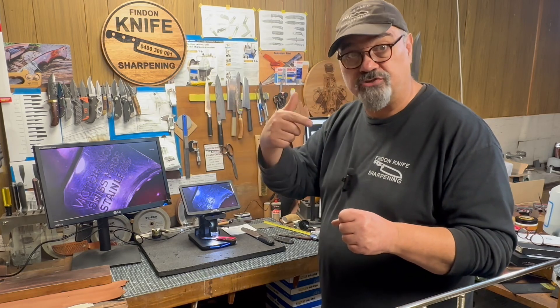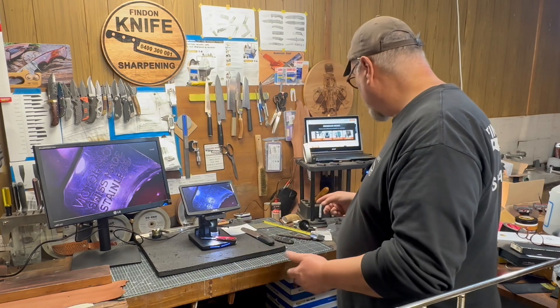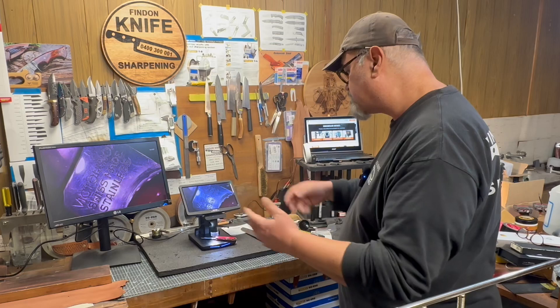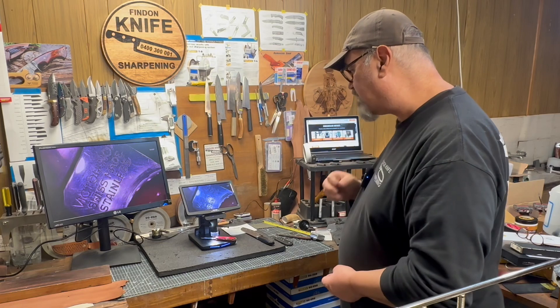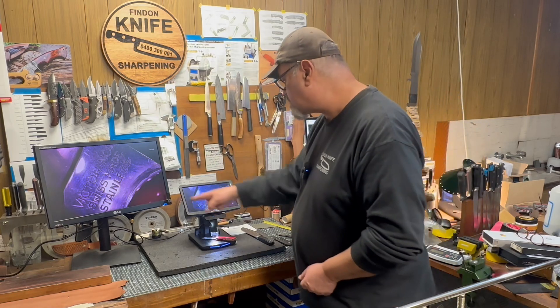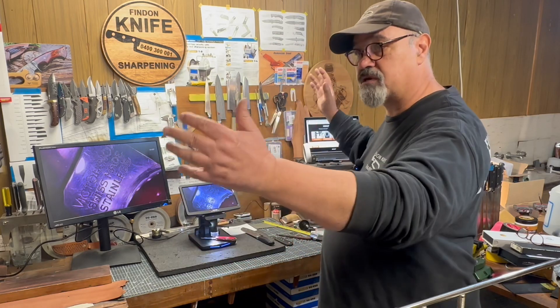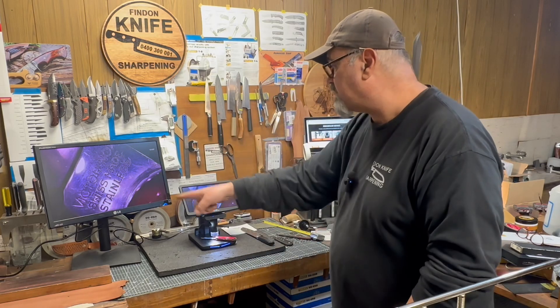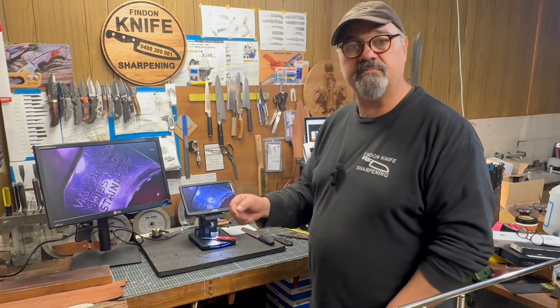I believe they have depots in all those areas - this one shipped from Australia and didn't take long. The American one ships from America, the Euro from Europe. It's got a remote control for zooming in and out and doing some functions. It's all pretty self-explanatory. I'm pretty happy with it. The screen is plenty good on its own, but I could also HDMI export it to my spare 42-inch TV.